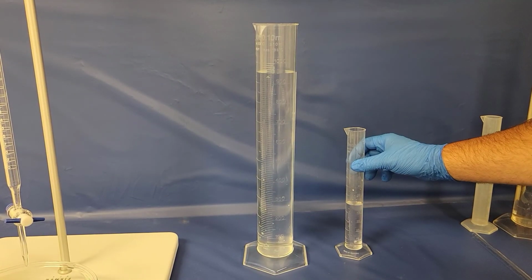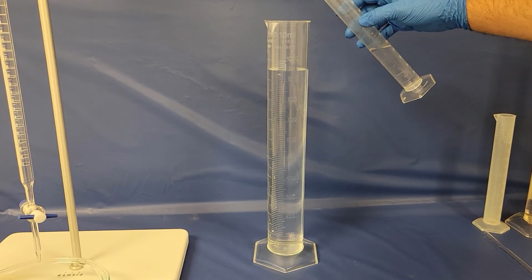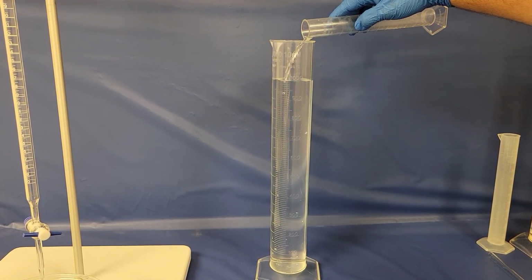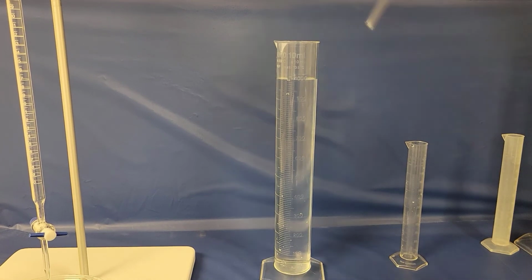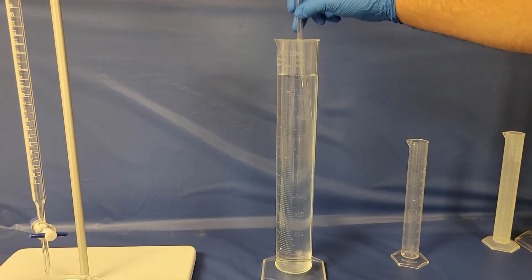So now we'll take our 50 milliliters of solution here, and we're going to mix it with our 950 milliliters of distilled water. All right, so there we go. And again, we're going to stir it up here, so that we can get a good solution mix.